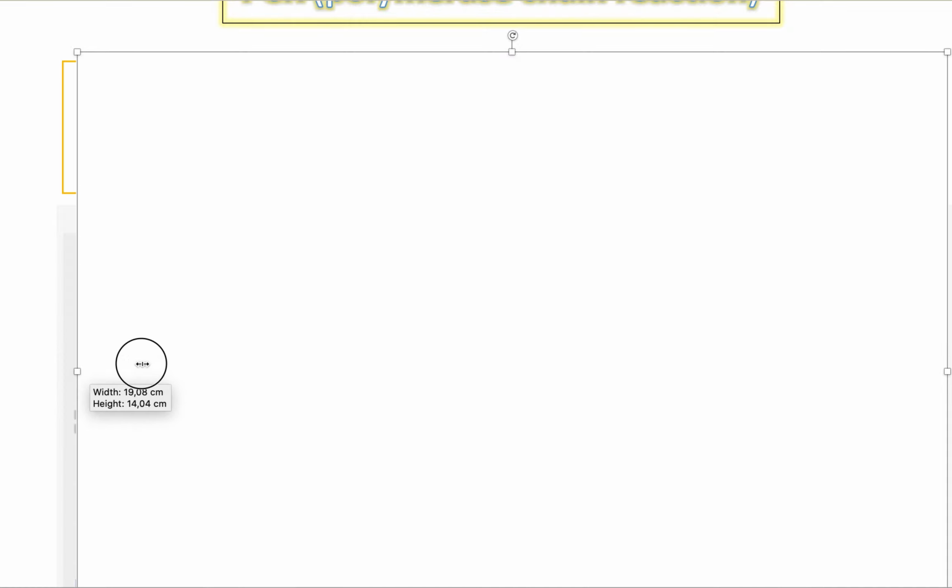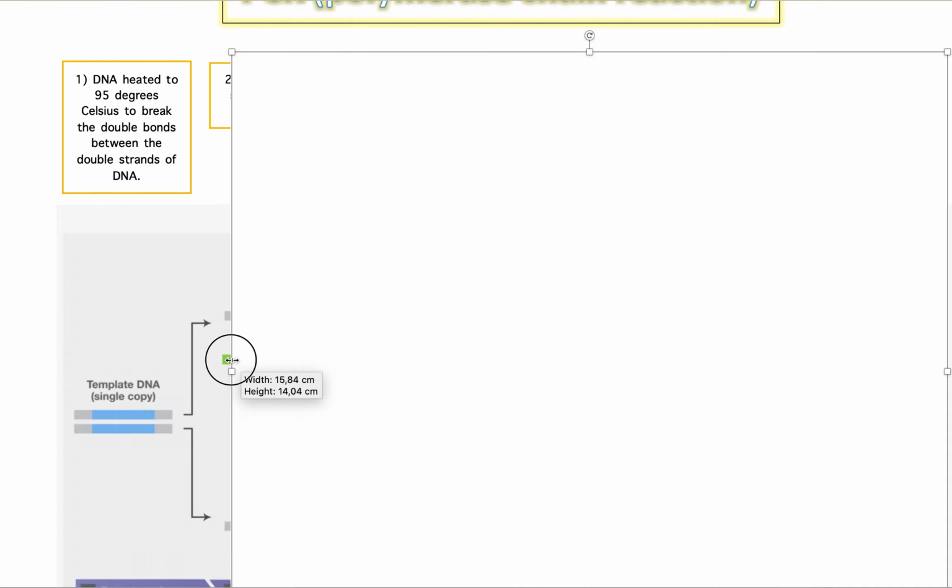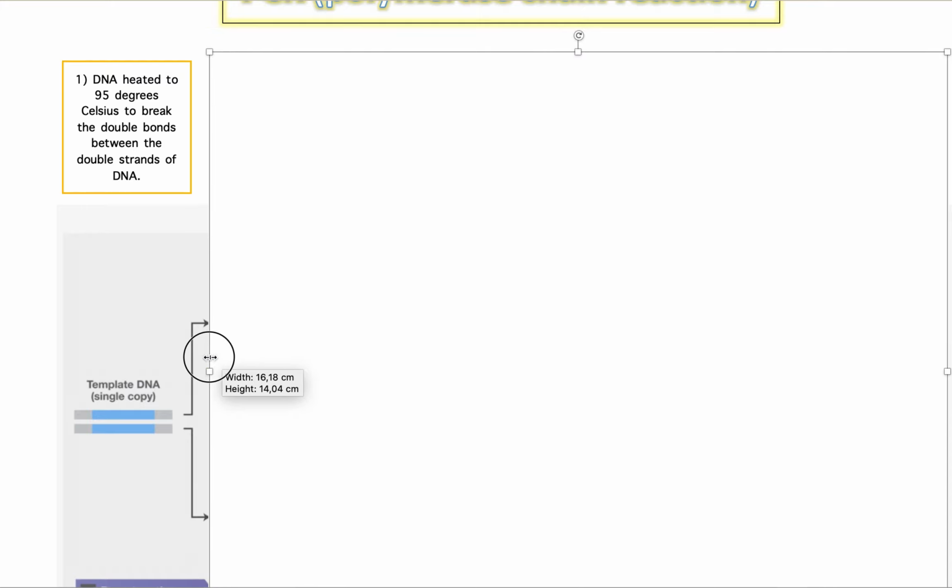So let's go. Now they're going to take this blood from the crime scene that was on the floor, and they're going to take it to the scientist, and the scientist will go into a lab and do PCR with it. They're going to put it into a machine. Let me explain what this machine does. There are 3 steps. It's not difficult. Just try and understand it.